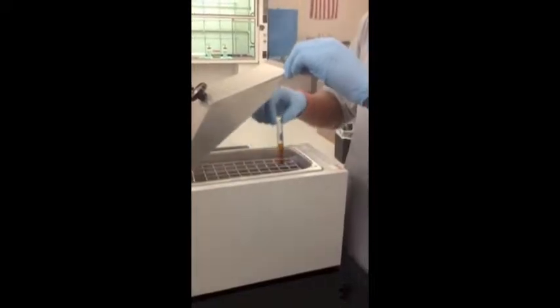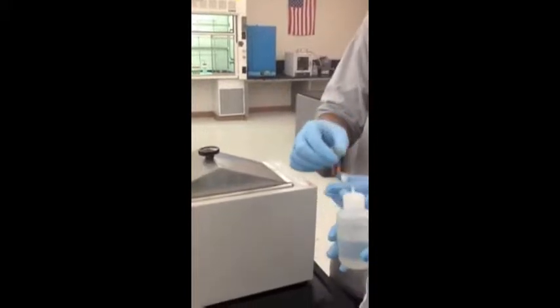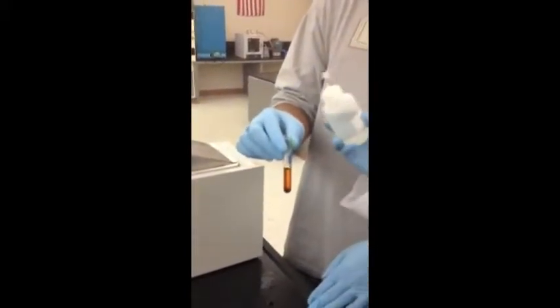Add this to the hot water bath, then add 3 M sodium hydroxide drop-by-drop until the brown color disappears.